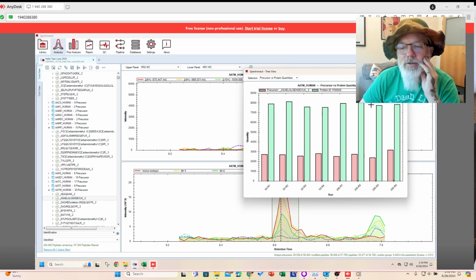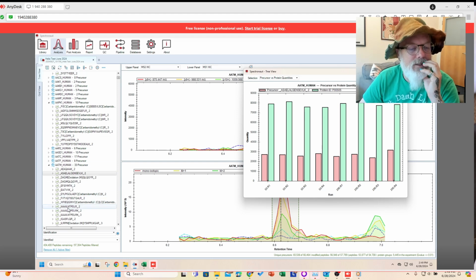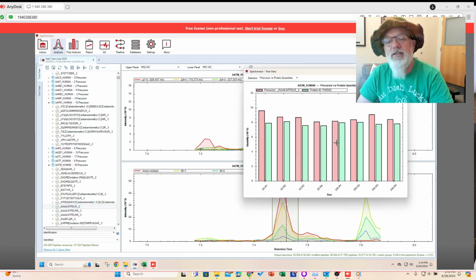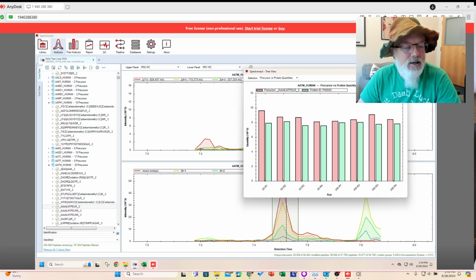Okay, we expect that from the proteins if the normalization's working. And that looks good, that looks good. So maybe deep quant has helped something here. So anyway, you may want to turn it on by default. It seemed to help the normalization correctly.